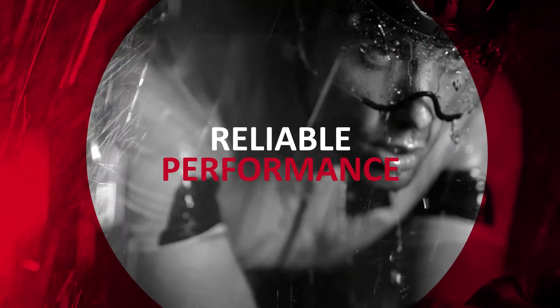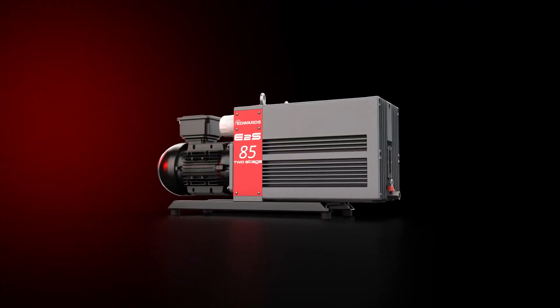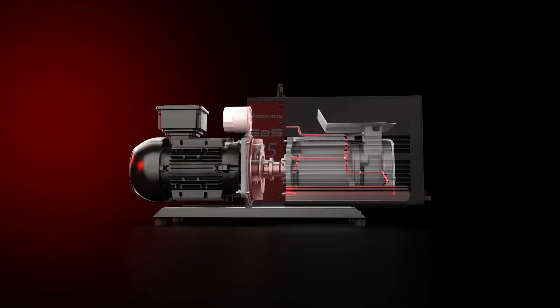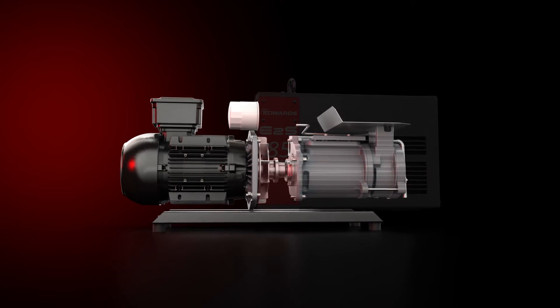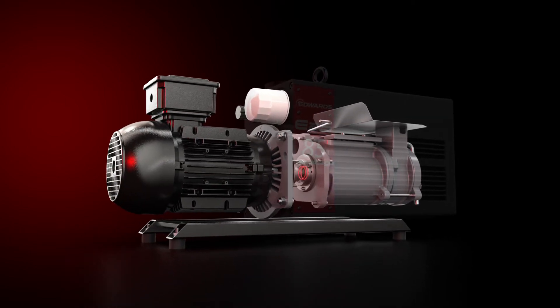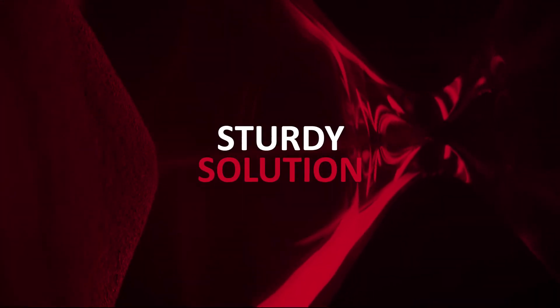The E2S was built to perform reliably, without hiccups and speeding through cycles. Your Edwards pump is a dependable partner. It features forced oil lubrication using its internal oil pump, and the leak-proof barrier is another way in which it makes sure it never fails your process. A sturdy solution that will stand the test of time.